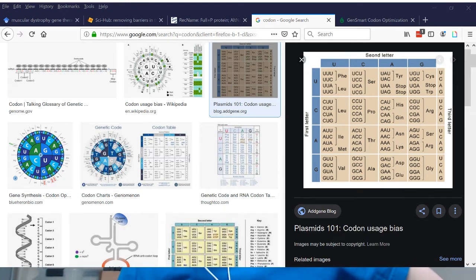All right. So now we look at our plasmid. We see, where is stuff being made? Generally, you can look for the MCS, right? The MCS is the multiple cloning site. That's generally where genes go, the multiple cloning site, because that's where they put all the restriction enzymes.